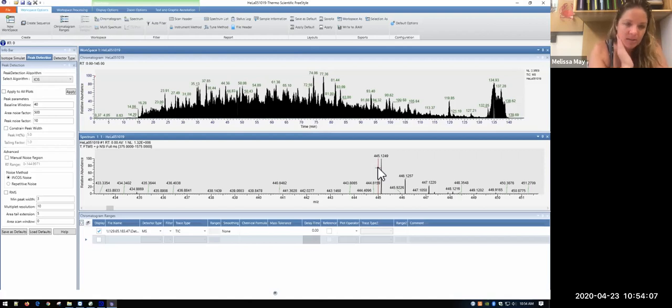If you're more interested in looking at one particular protein, Proteome Discoverer can help you look for post-translational modifications. But if you wanted a little more information, or wanted to double check that the instrument was identifying your peptide correctly or quantifying your peptide correctly, or if you wanted more information about a post-translational modification, you could come in here and do it manually.